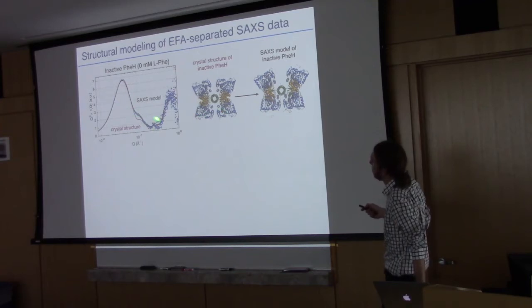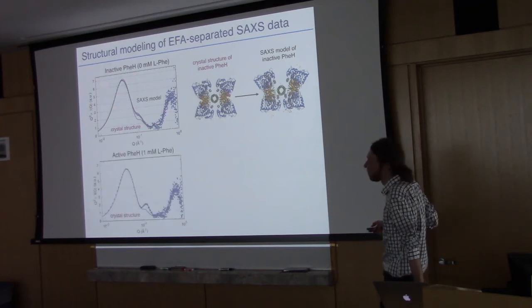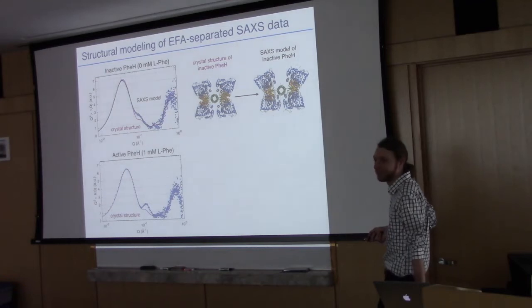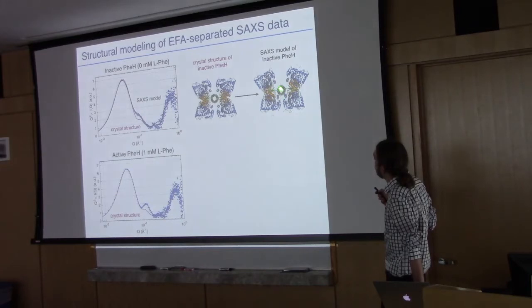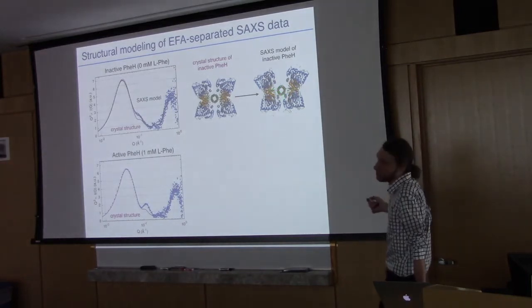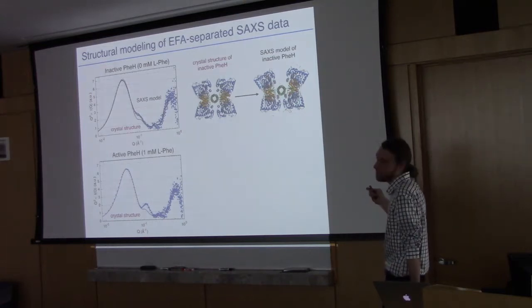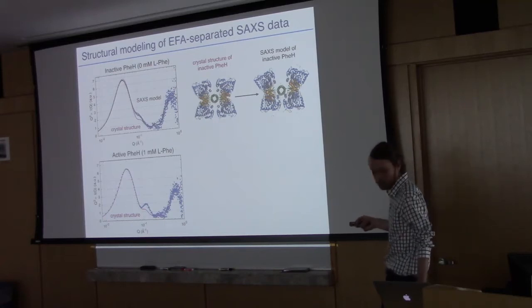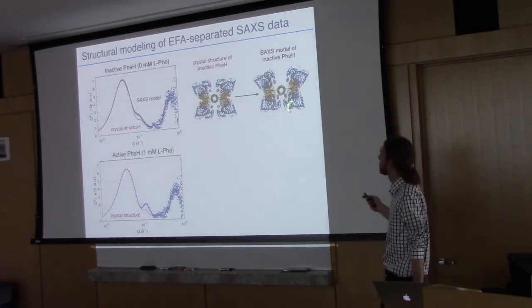This is now showing the black curve. Okay. So in the model, you move it by changing some distances? Yeah, so what the program did is it generated lots of different models that were possible, given that the domains might run into each other and that the linkers had to be a certain length. And then it selected the one that gave the best fit to the data. I see. So the program did it for you. Yes. I just set it up and then ran the program and said this was the best one.